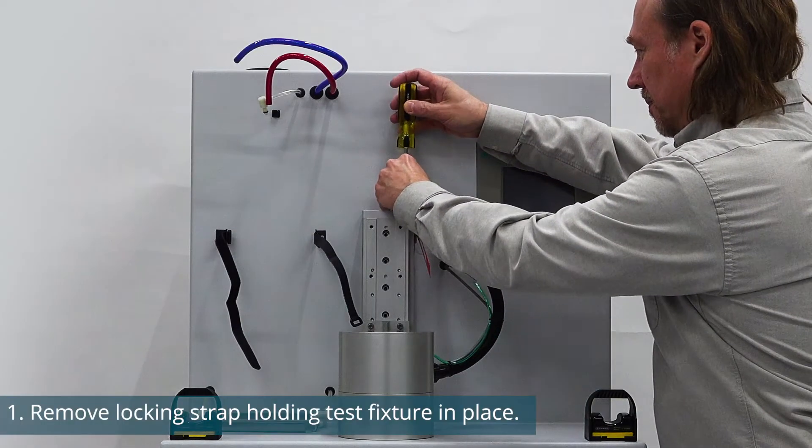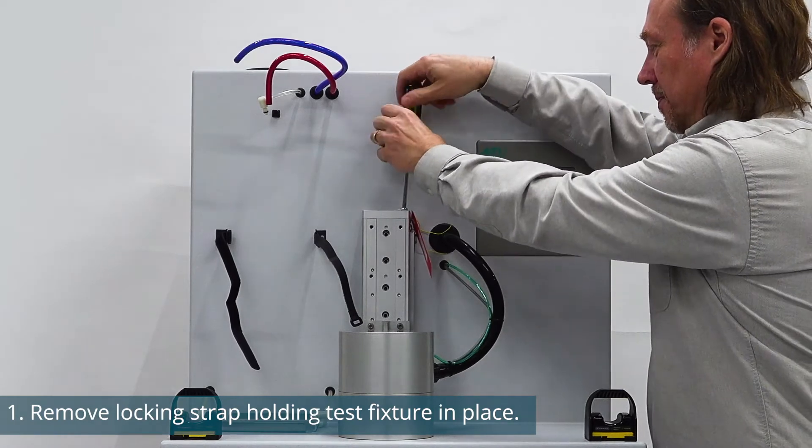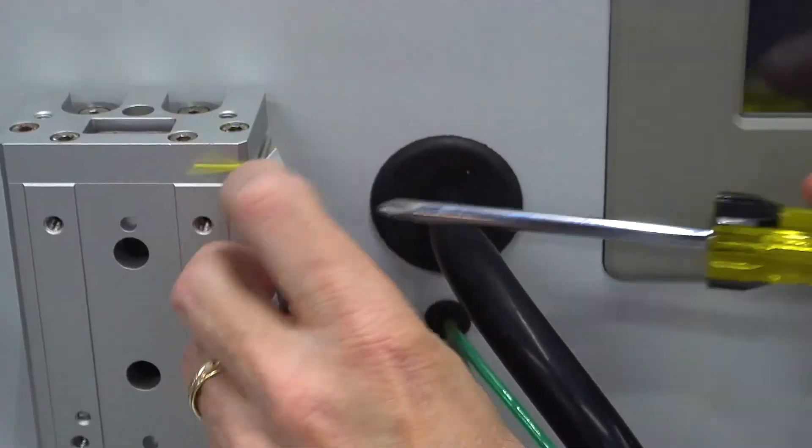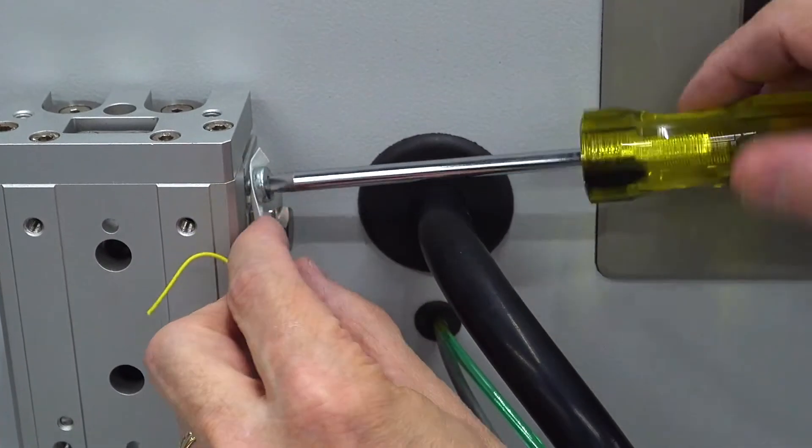Once it's on a sturdy surface, remove the locking strap holding the test fixture in place. This is only necessary for manual and hybrid configurations.